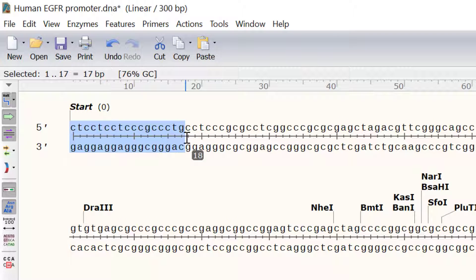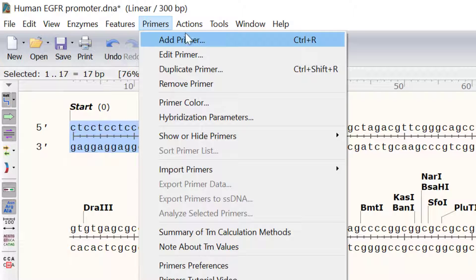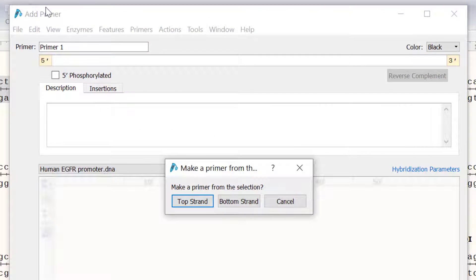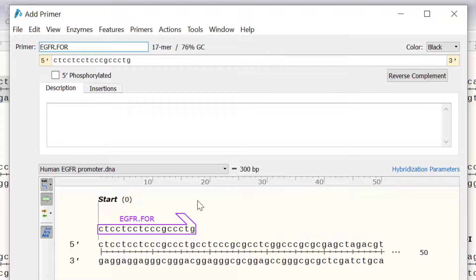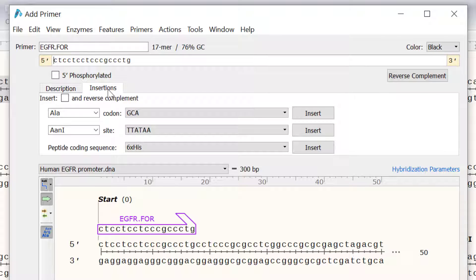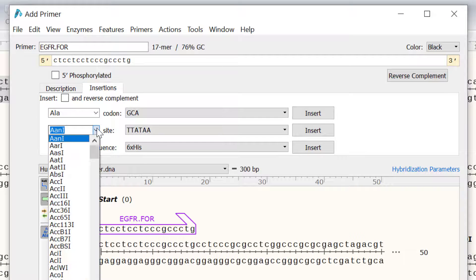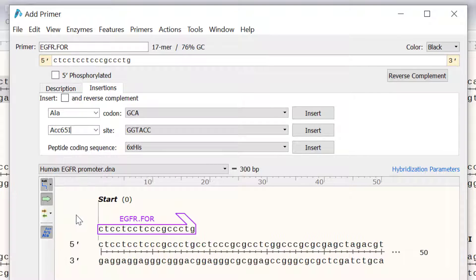To add this as a primer I will go to Primers, Add Primer. Since this will be the forward primer I will select to make a primer from the top strand sequence. I will then call this primer EGFR.FOR and I will also add a short description for my own reference. Next I will switch to the insertions tab. Here you can add codons, restriction sites or peptide coding sequences by selecting an option from the drop down menus. For this example I want to add a restriction site for Acc65I to the start of my primer. So I will click on the beginning of the primer sequence and then select Acc65I from the drop down menu and click insert.